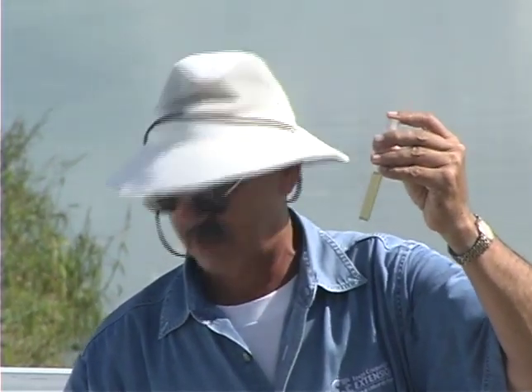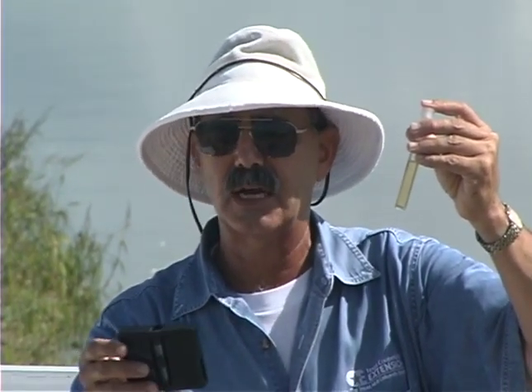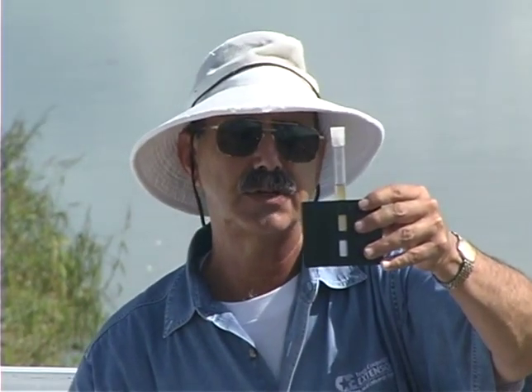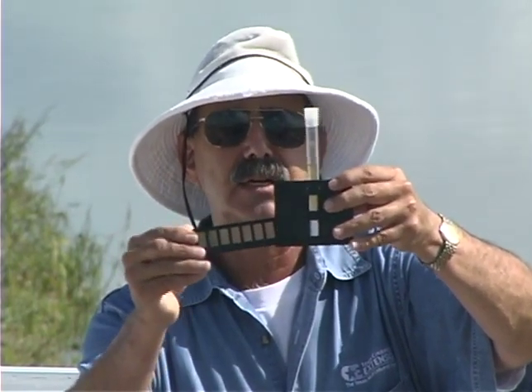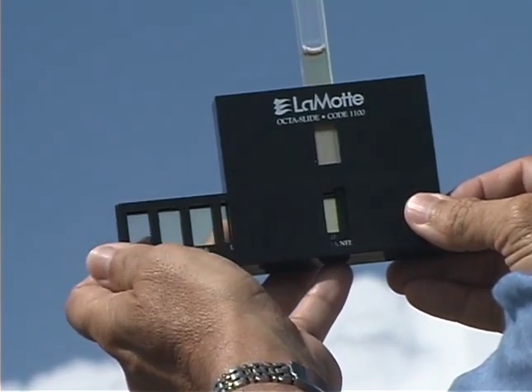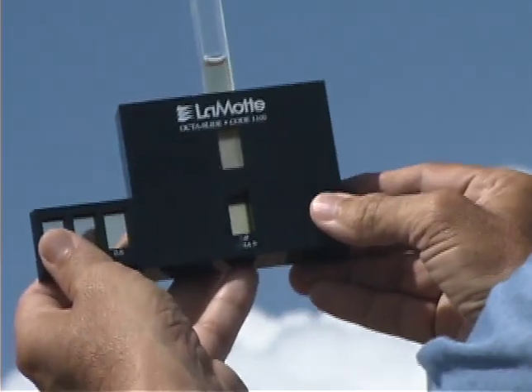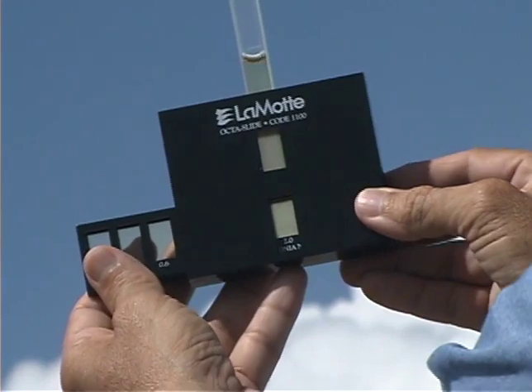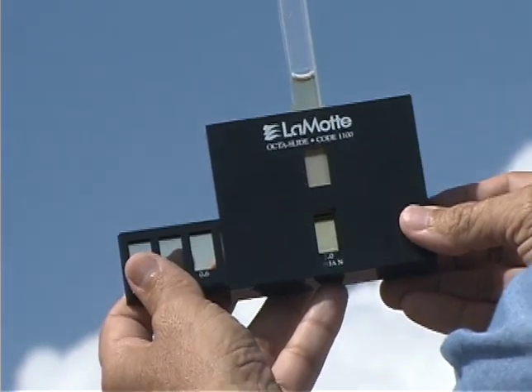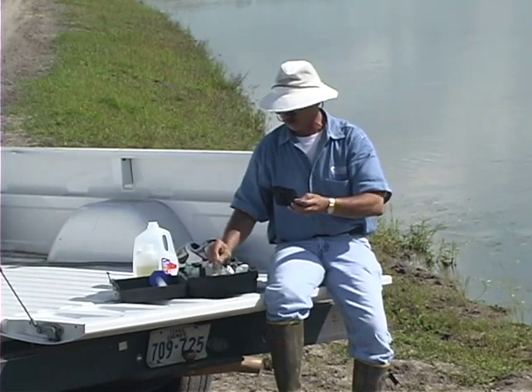Now with the LaMotte kit, the way we determine the ammonia level is with what they call an OctaSlide viewer. We insert the sample into the plastic apparatus here and use a color comparison strip to determine what our actual ammonia level is in that water sample. Unfortunately, with this particular water sample, our total ammonia nitrogen concentration is too high to read on the scale that comes with this kit, so we'll have to dilute our water sample to get back down within the range of the scale.